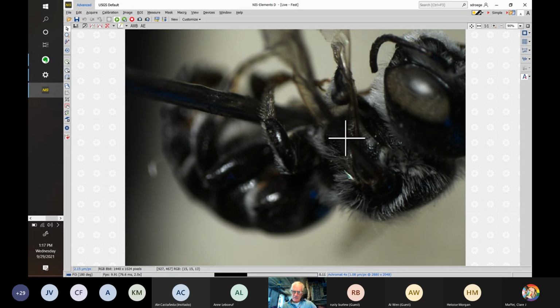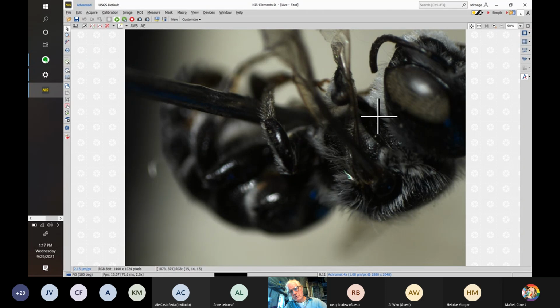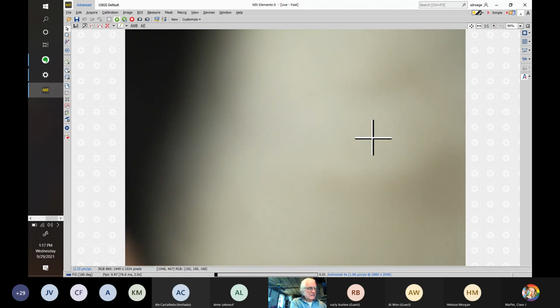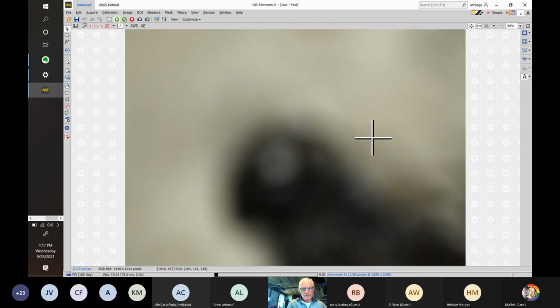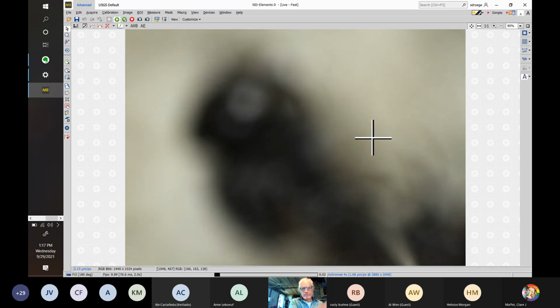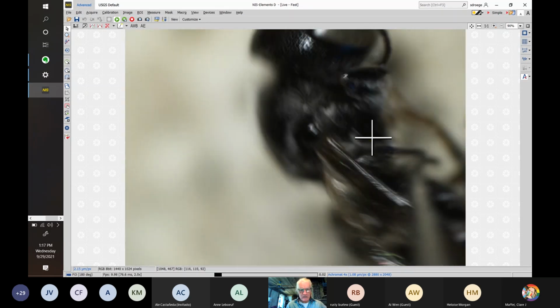Sometimes in the old literature it would be the pleura, and I'm sure there are other names too. So this is not formed well, so I'm going to change the position, but there would be the anterior. There's something of the sharp line showing up there, but I think perhaps on the other side of the specimen we have a better view of the carina and the two faces.